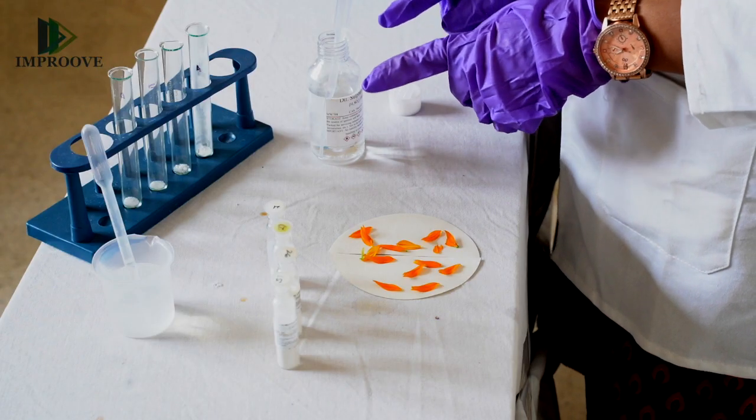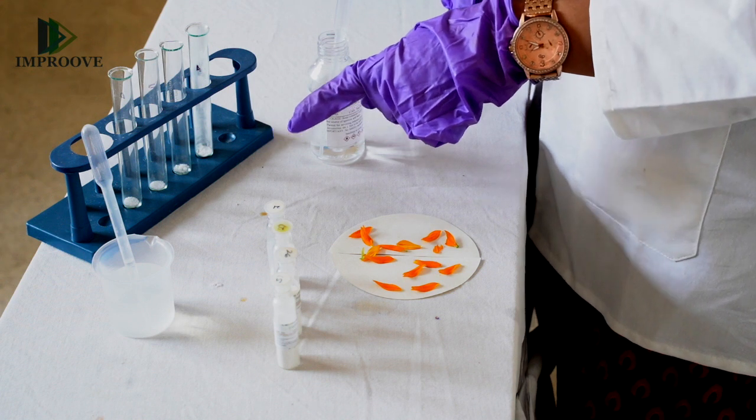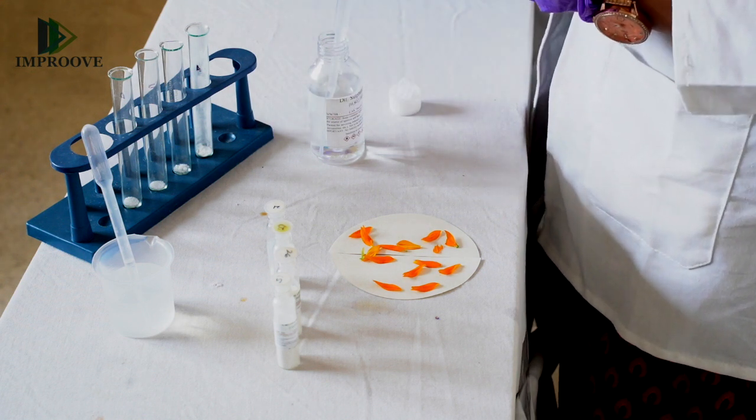In this experiment we will identify the bleaching powder among the given samples. For the experiment you will need dilute sulfuric acid and at least four test tubes. If you have more test tubes you can take about eight, but if you have four you can stick with four.